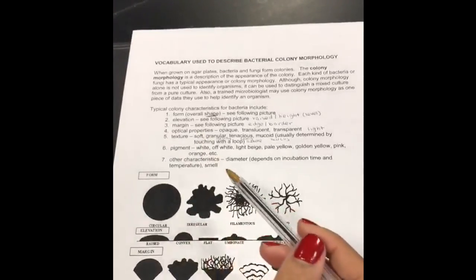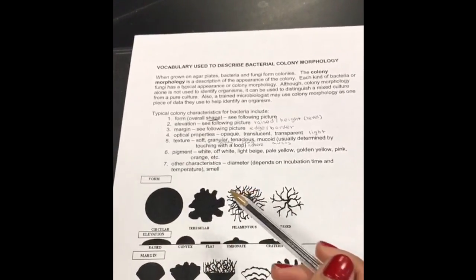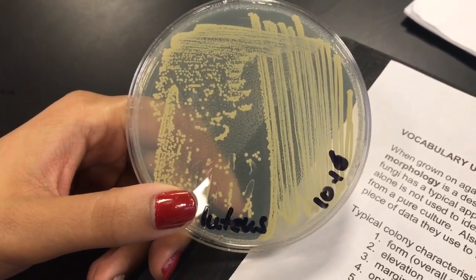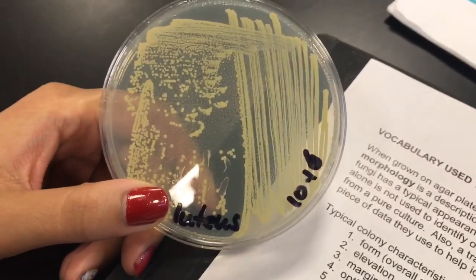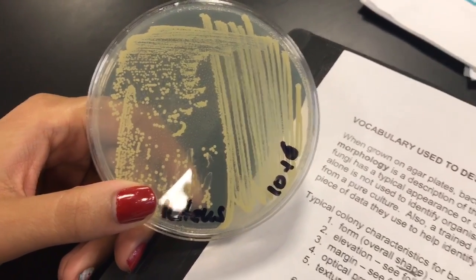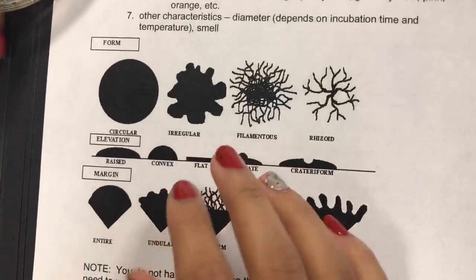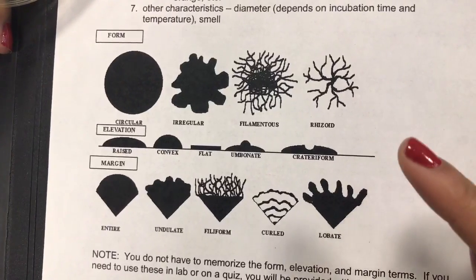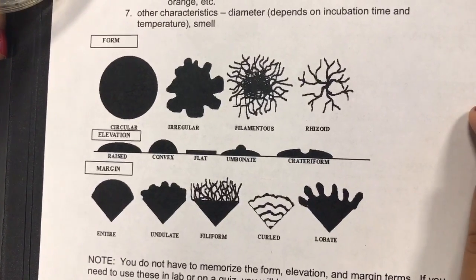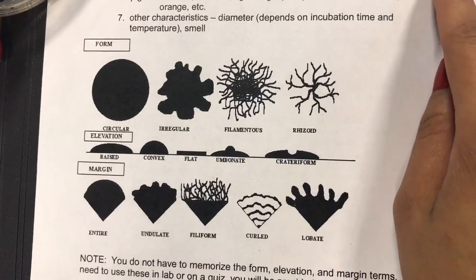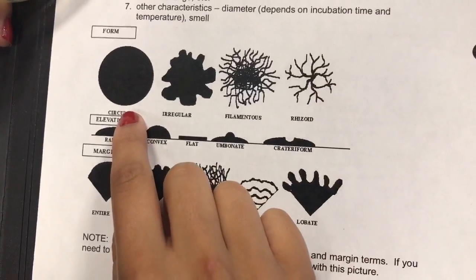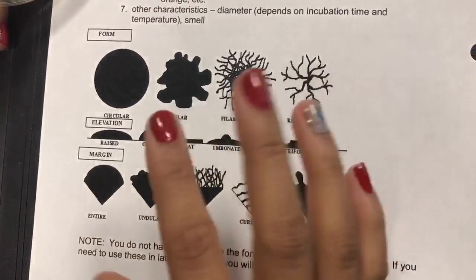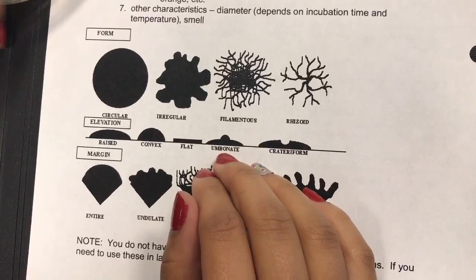We're going to use this streak plate to practice colony morphology and identify the appearance of these colonies. We'll go through page 44 to help characterize the bacteria. This streak plate is a pure culture, and its overall form or shape is circular. Its elevation is either raised or convex — both would probably be appropriate in this case.